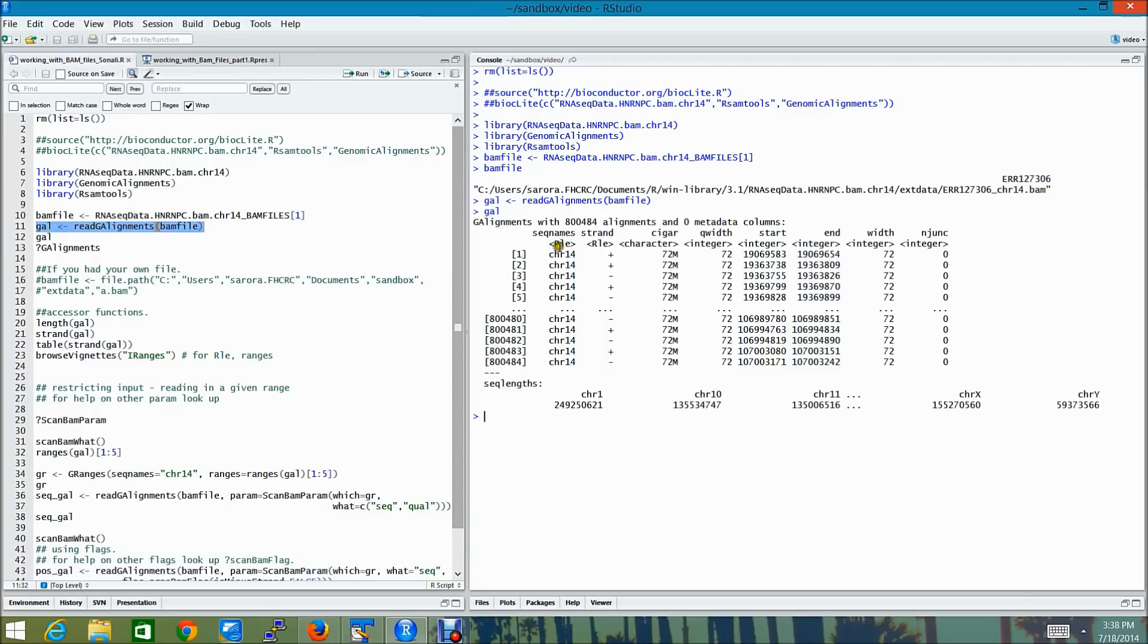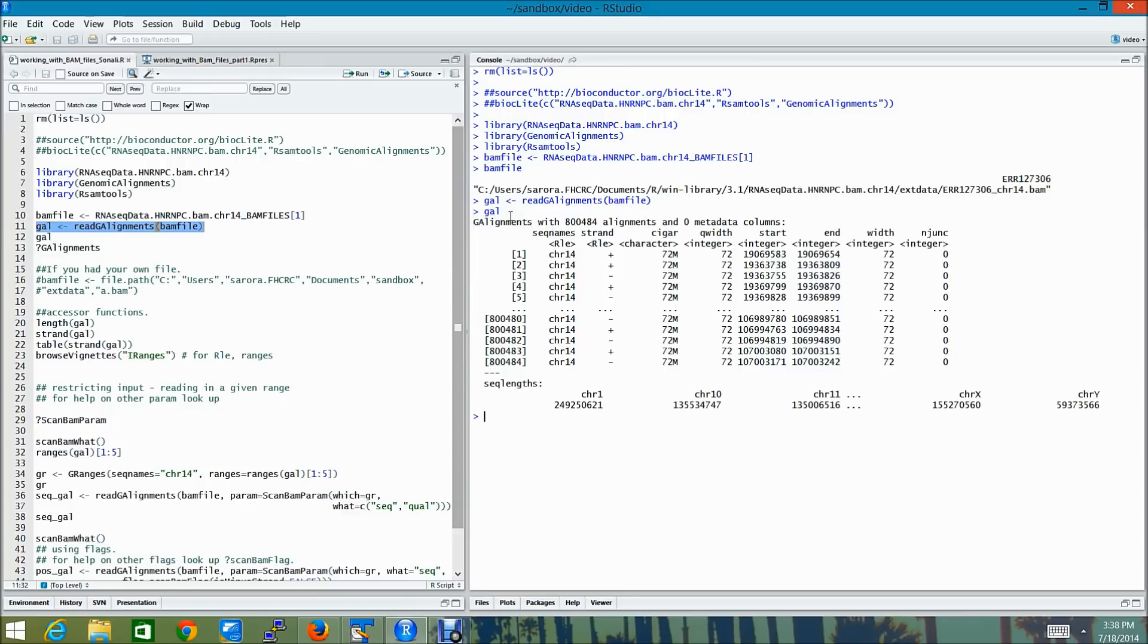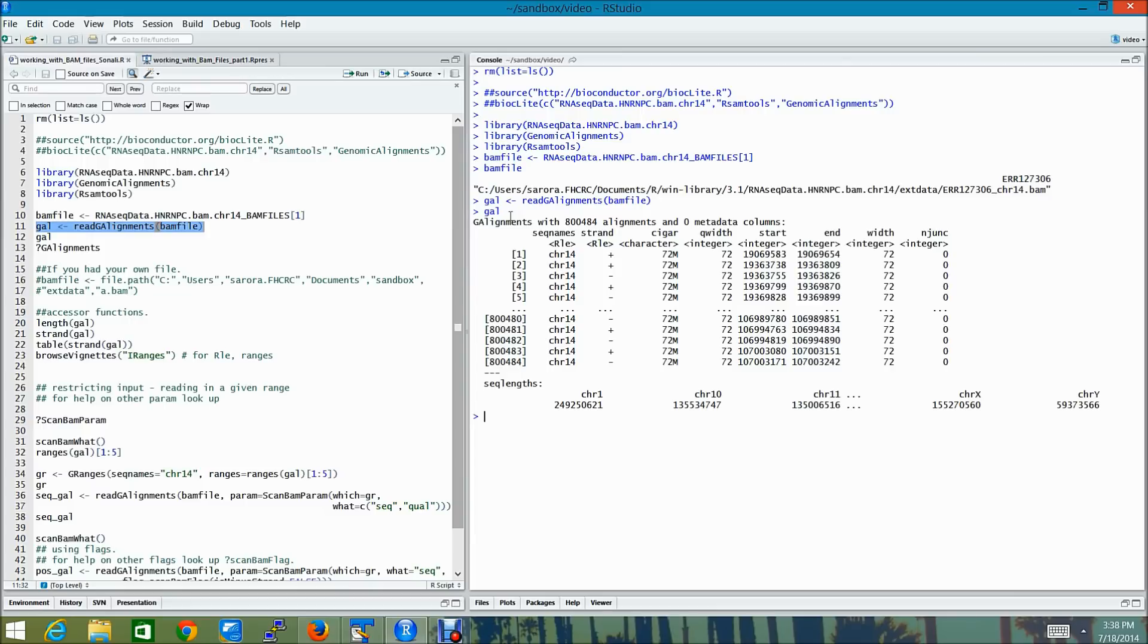Each element of the g-alignments object consists of the name of the reference sequence. This is the R name field in the SAM BAM record. The strand in the reference sequence to which the query is aligned. The cigar string which is in the extended cigar format. The start and the end, which is the one-based leftmost position coordinate and the one-based rightmost position coordinate of the clipped query relative to the reference sequence.